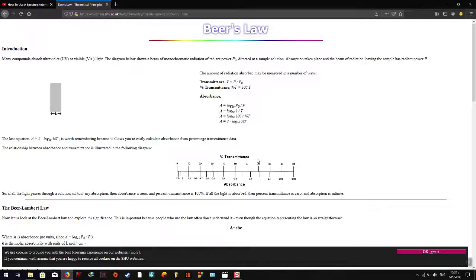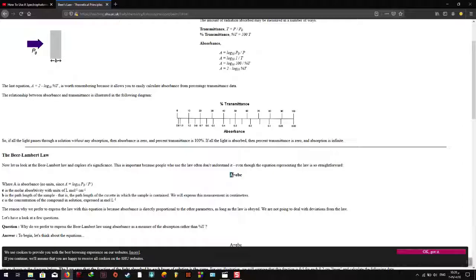Now you could ask: if we can only calculate the concentration from a known concentration, the standard, how could they calculate the concentration of the standard if there was nothing before it, or if it also requires another sample whose concentration must be calculated? There's another formula used to calculate the absorbance, which says that the absorbance is equal to the molar absorptivity, which is a constant.